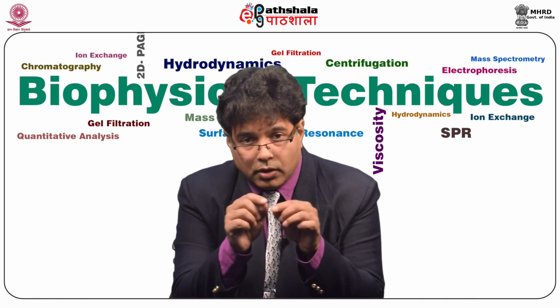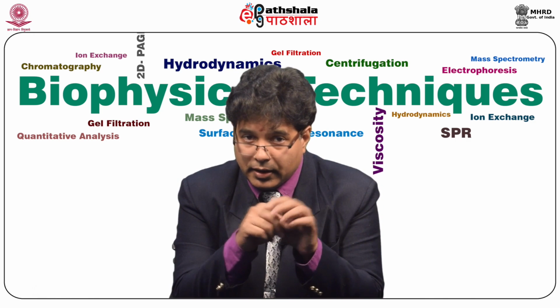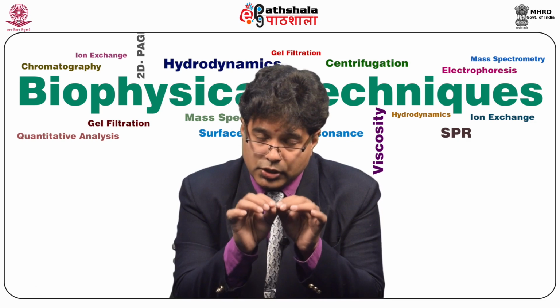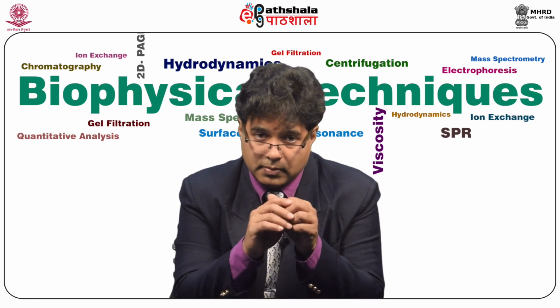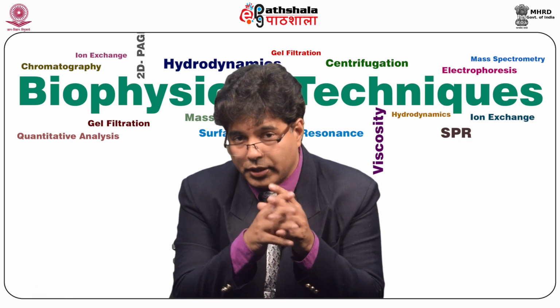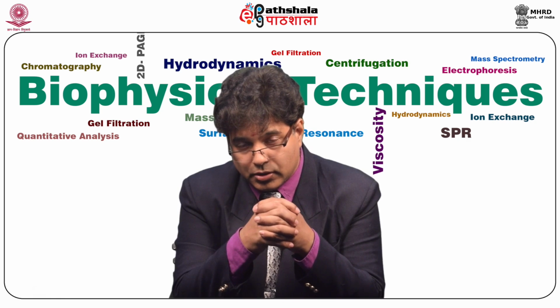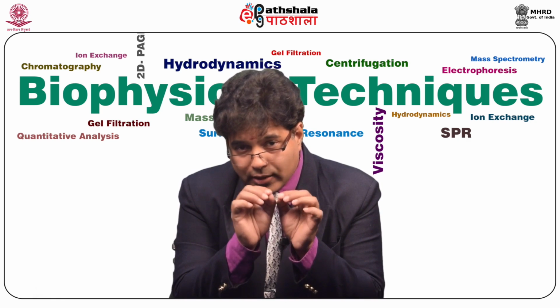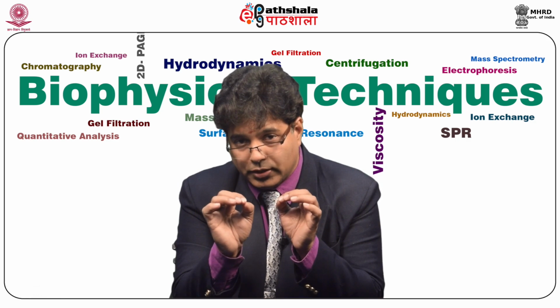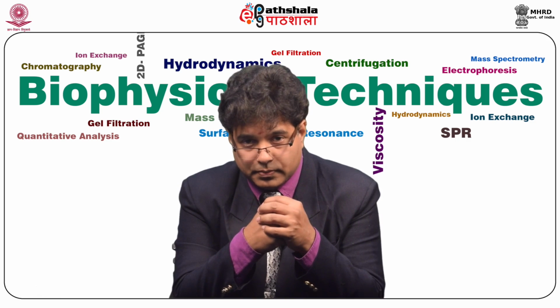The quadrupole is four rods arranged in a square, through which the charged particle is allowed to pass. The acceleration is done classically by using an RF (radio frequency) voltage and a DC voltage, which are alternated to isolate or resonate a particular mass, so that it can be isolated, accelerated, and propelled towards the detector.